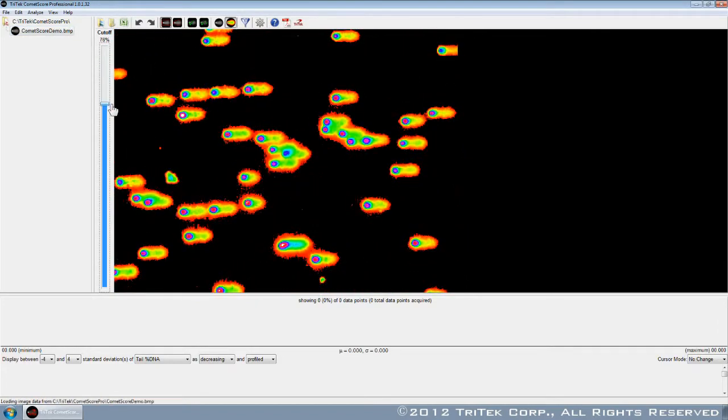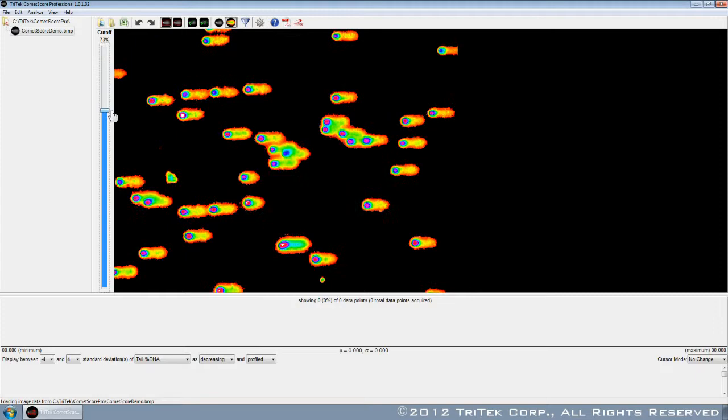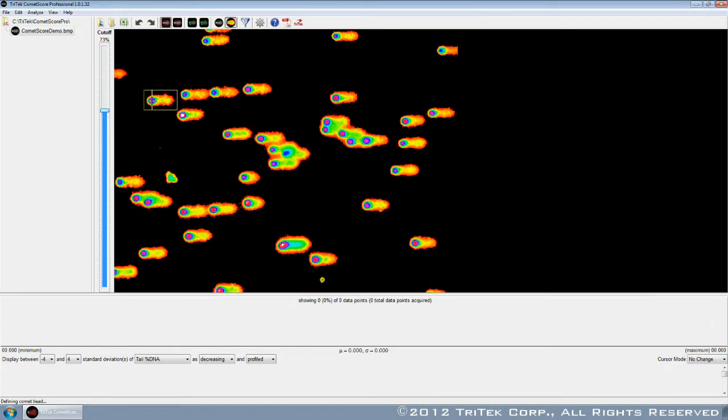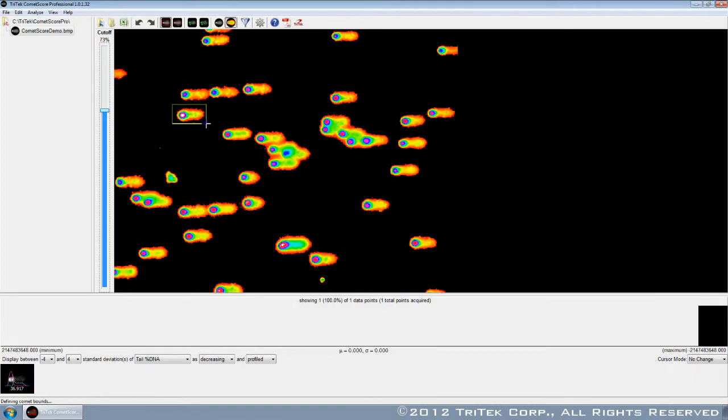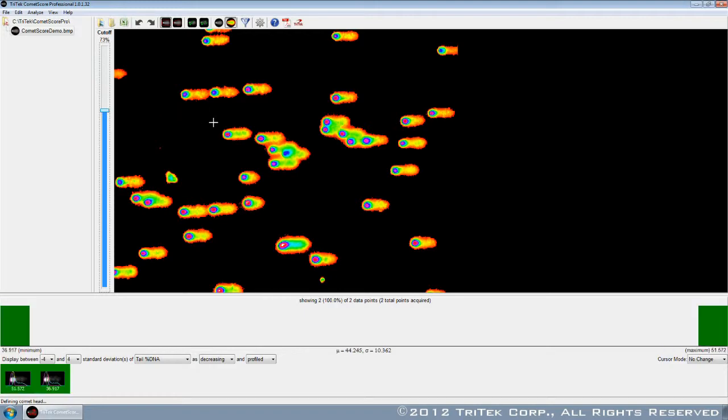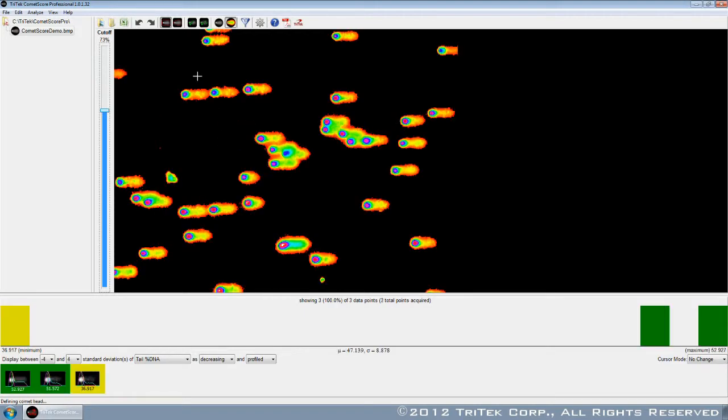Even in its tried-and-true manual mode, CometScore Pro is able to import image data, compensate for background noise, and isolate individual cells. In this classic two-click technique, the user defines each cell and its center, allowing the program to score the comet.